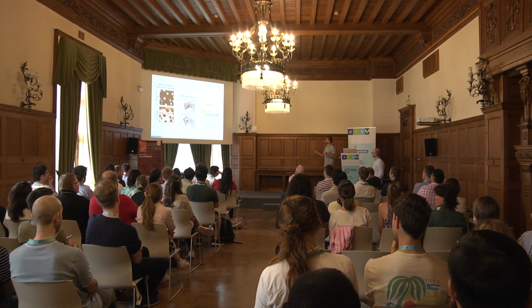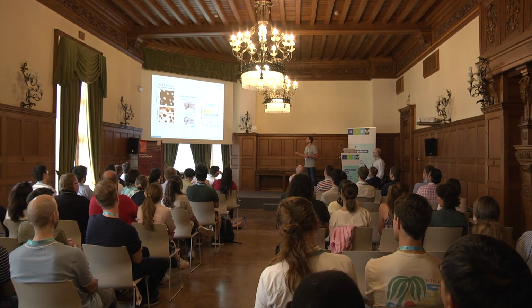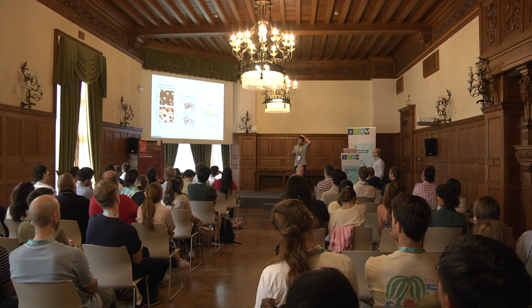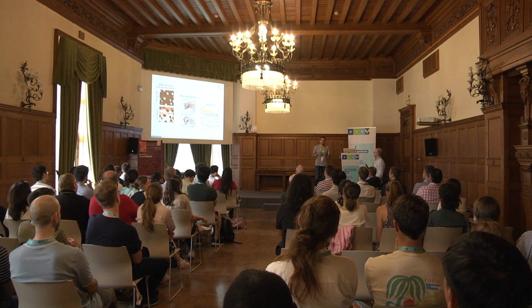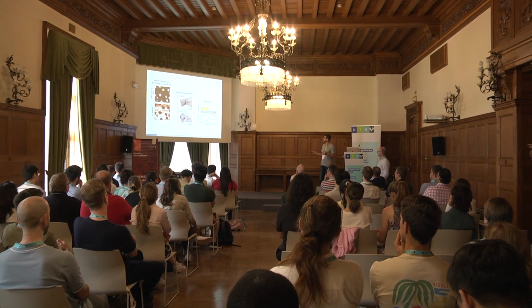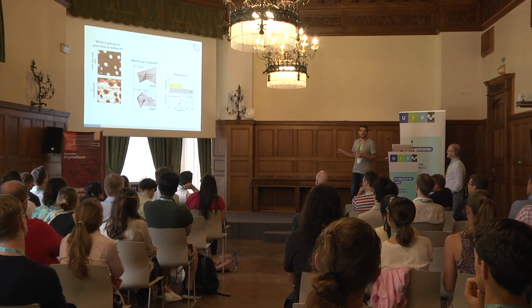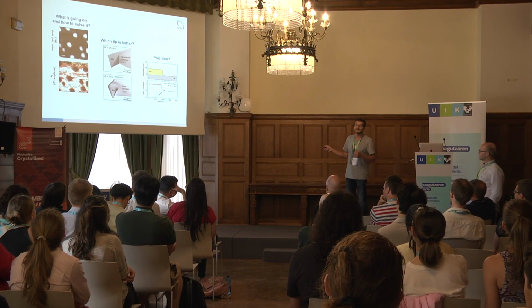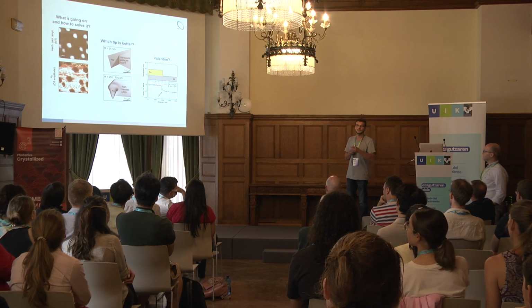Now here, at this edge, you all know, we've seen it already quite a bit. Typically, you see a lot of fringes, and we know that if you have a polariton that is quite damped, like on bismuth selenide, Martin showed yesterday some images from us, then very often you see only one fringe or a fraction of a fringe. So it's on the scale. It could be a polariton, right? Is this one here or not? Or who has seen this already close to topography edges? Has somebody seen this already? Yeah? Vladimir? Again?